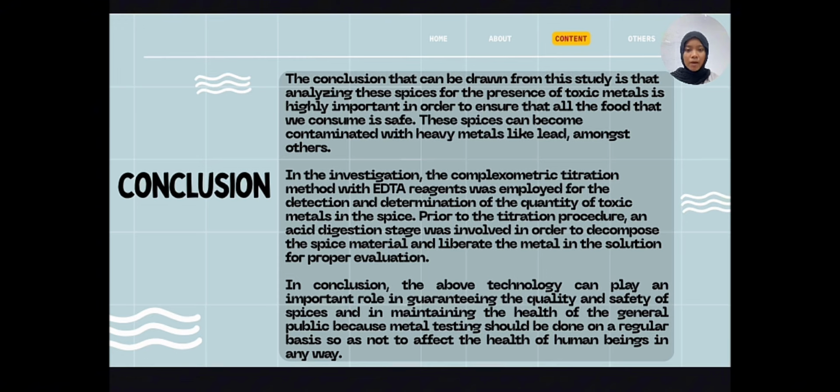Overall, the method used in this study plays an important role in ensuring the quality and safety of spice and in protecting public health. Therefore, regular testing of toxic metals in spice is necessary to minimize potential health risks to consumers.